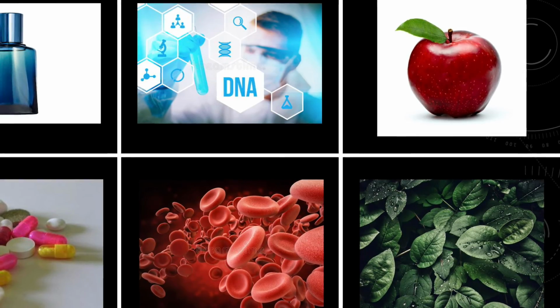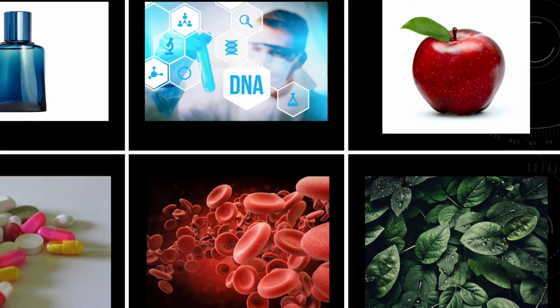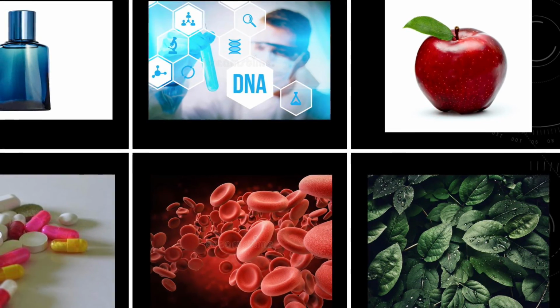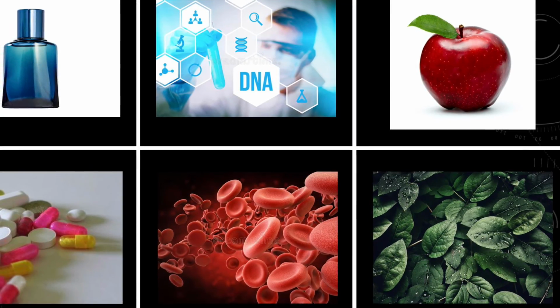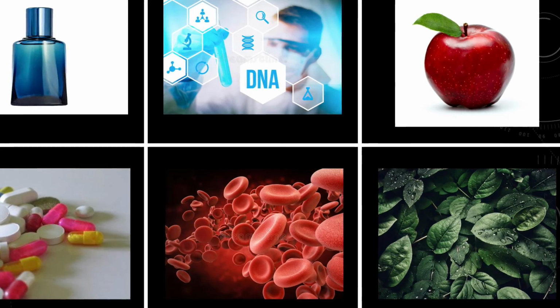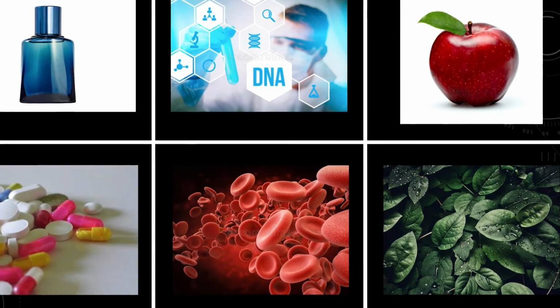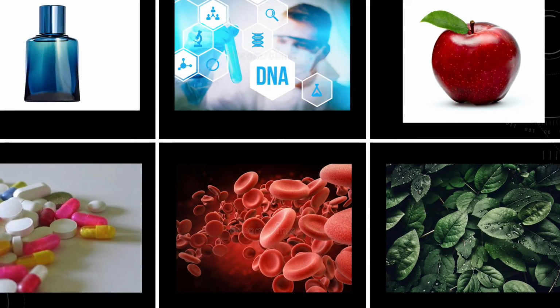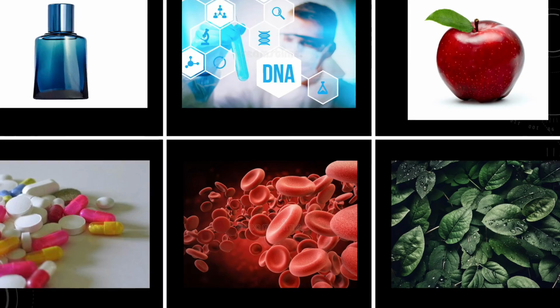The GCMS can be used in various fields, such as medicine for testing for congenital diseases. It can be used in the environment to test for any sort of pollutants. The GCMS can also be used for the analysis of all types of oils and perfumes. It can be used in pharmacy to detect impurities in active pharmaceutical ingredients. It can also be applied in medicinal chemistry in synthesis. Finally, it can also be used in forensics in many different areas, such as arson and toxicology.